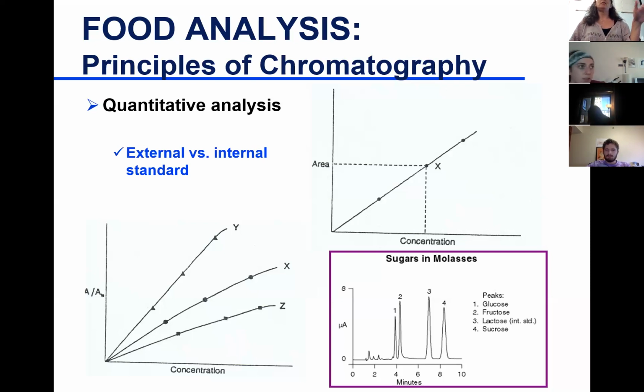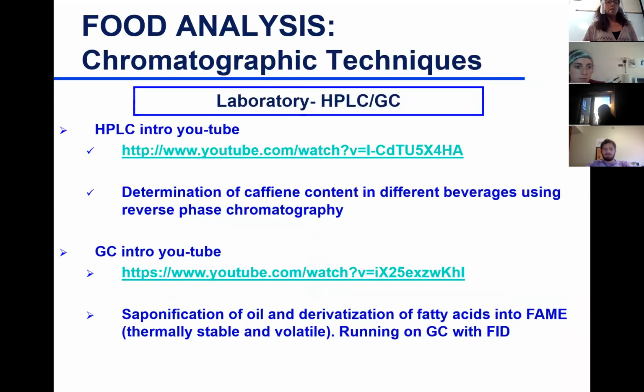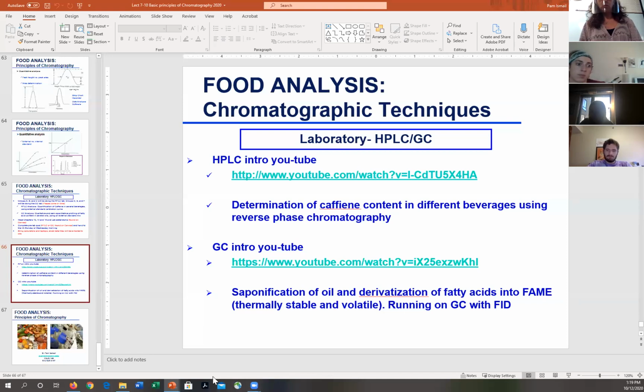Any questions about external versus internal? One thing I want you to remember, you need external for quantification, internal to correct for errors. All right. So there are these two YouTube videos that are really nice to watch on your own time. I will make them available on Canvas, but there's one for HPLC and one for GC. All right. So moving on to the HPLC.